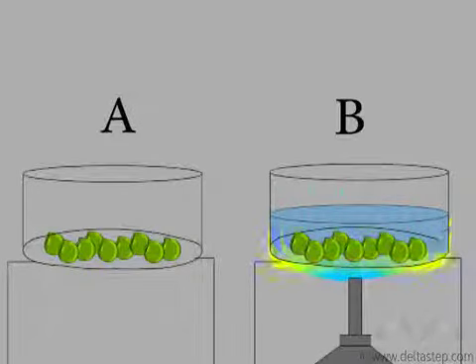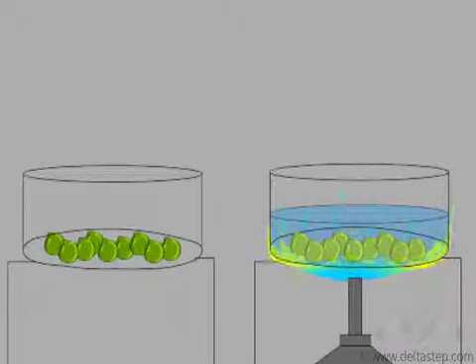Now, let us perform a simple experiment to see if oxygen is taken up during respiration. For that, let us take 2 Petri plates and let us take a few beans. The beans in Petri plate B are heated, so the beans in Petri plate B are heat killed, while the seeds in Petri plate A are living or germinating seeds.